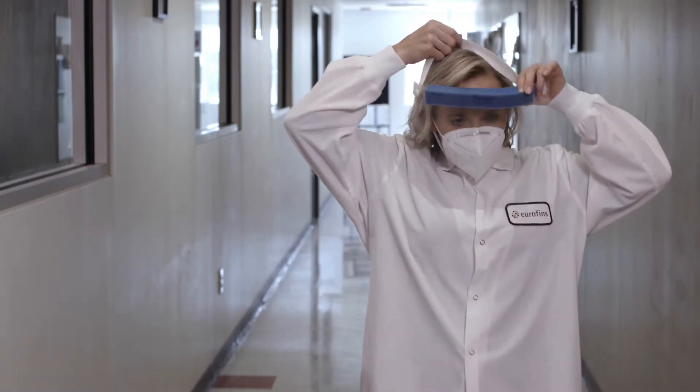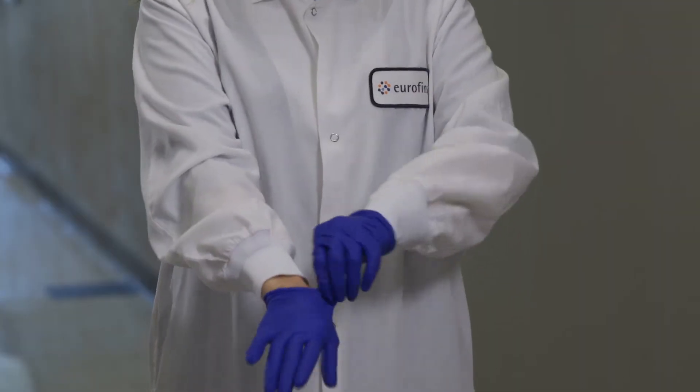Personal protective equipment, also known as PPE, is critical to ensuring your safety and the integrity of the samples that you obtain as part of your environmental monitoring plan.